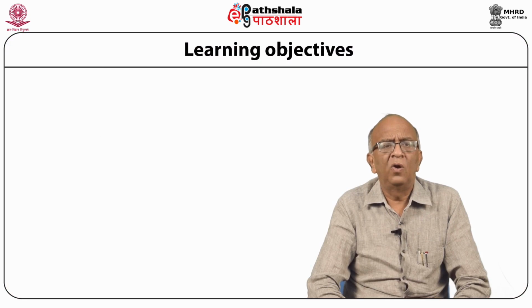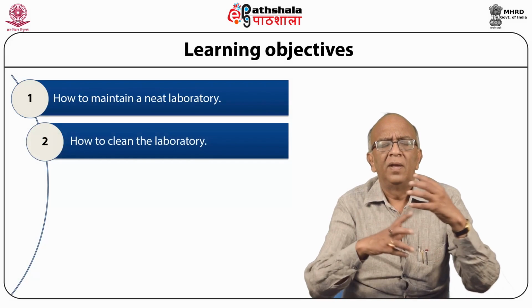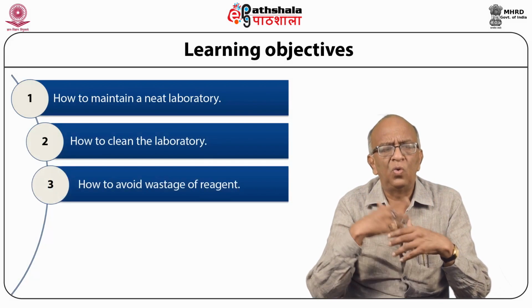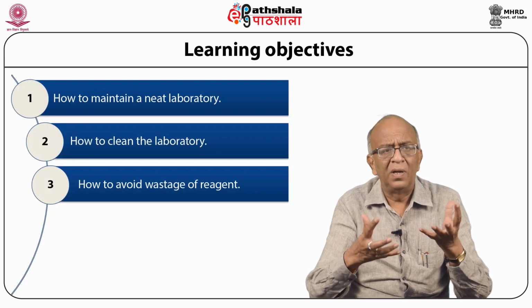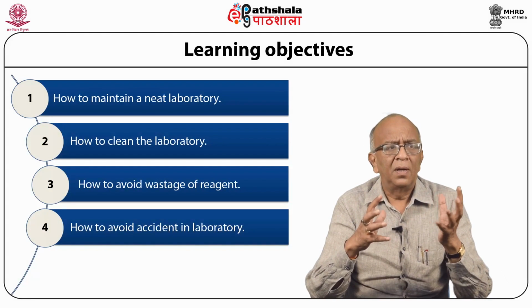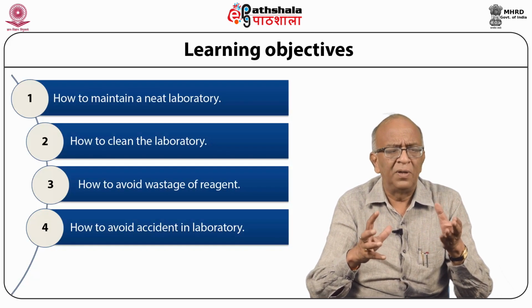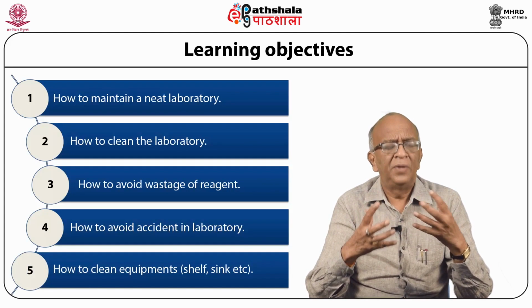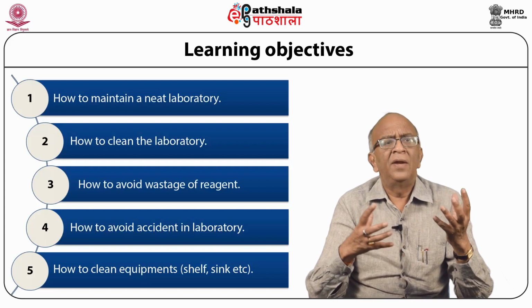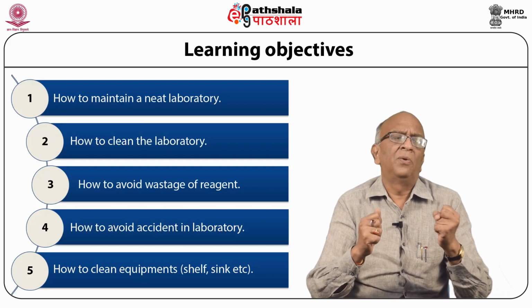Here, learning objectives are how to maintain a neat laboratory, how to clean the laboratory, how to avoid spilling of the reagents on your working table, how to take care that no accident takes place, how to maintain your clean sink, wash basins and shelves and your passages in the laboratory.